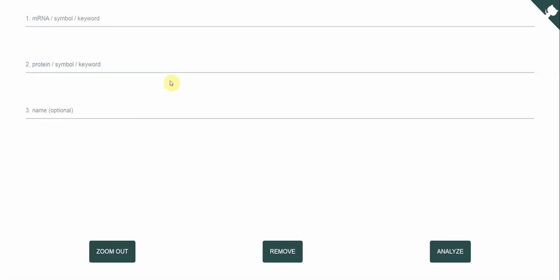So I just want to recap why I decided to have this tool for MitaFrame as a module. Recently I was contacted by one of my colleagues who happens to be a medical doctor and he sent samples of a patient to two distinct labs.